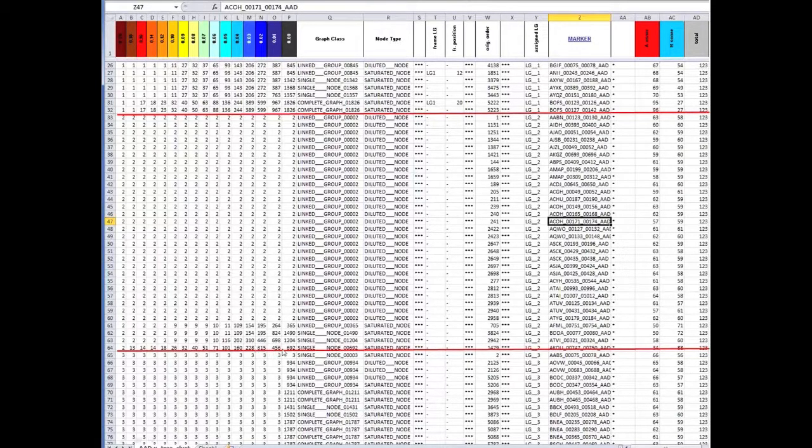The one thing I want to point out is that we don't usually keep, say, this bottom marker here, because it's kind of on the edge. This marker is part of group 2 at 20%. Sometimes you'll see a number of markers down there, and those you might question further, depending on the genetic distance, when you look at things later.